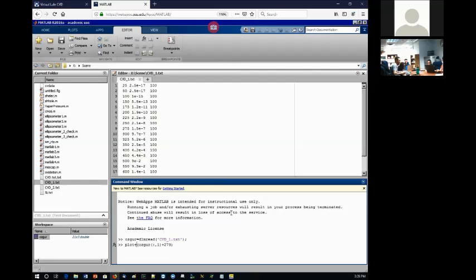And then next, I have to plot not this, but 1 over this value because I'm plotting 1 over temperature. So put 1 divided by this, and before the division put a little dot. So this is my x.